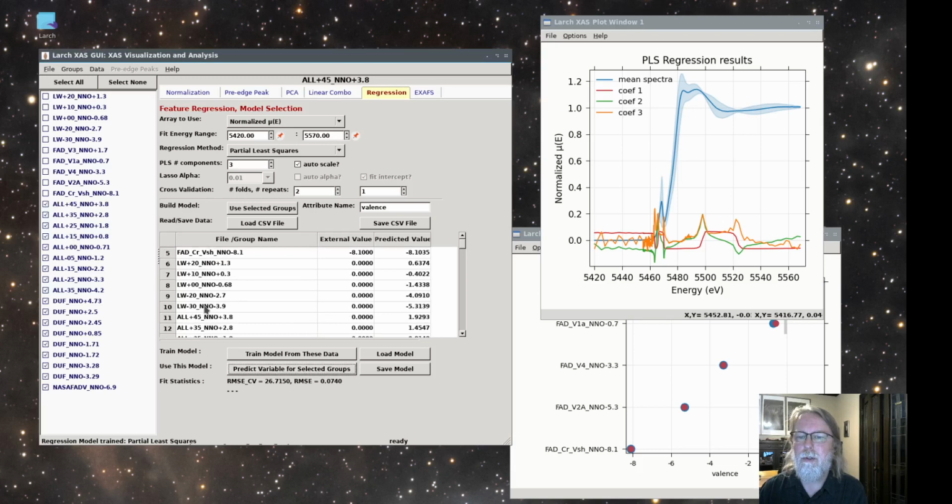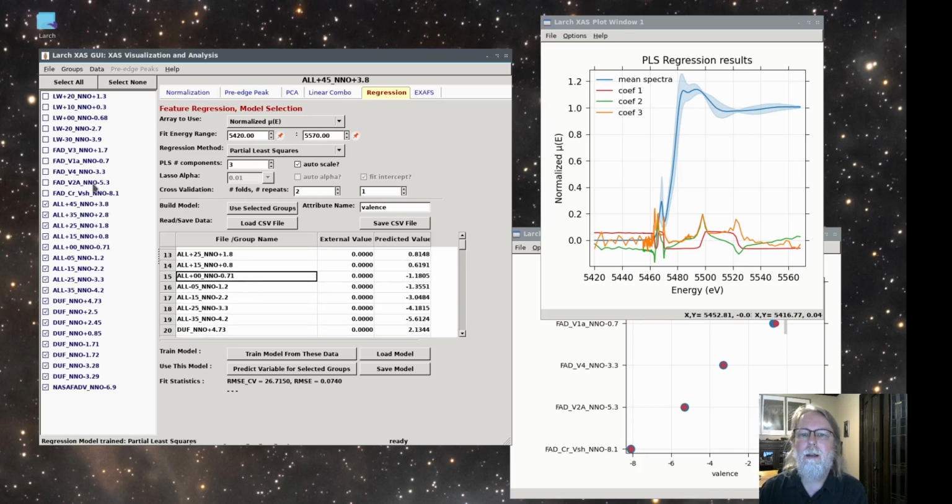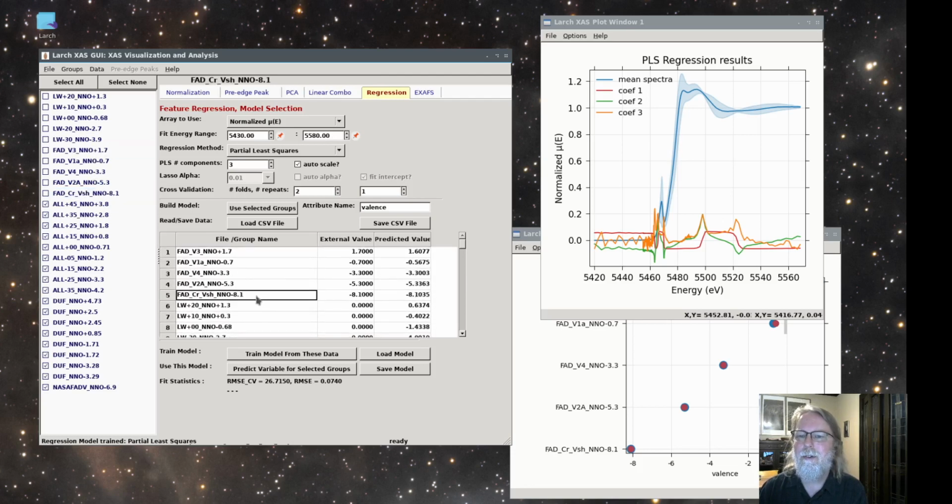So for the LW series, it seemed to work pretty well. For the AL series, what should have been +3 is 2, and 1.4 for 2. So it looks like here we're also off maybe by a scale factor, because as we get to 0.8 is pretty good, and 0.1. In fact, you can see that the FAD data we started with had a pretty good range, but a limited range of fugacity values from -8 to 1.6 without a whole lot of richness to its sampling.